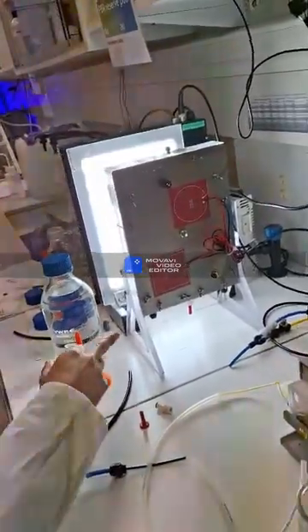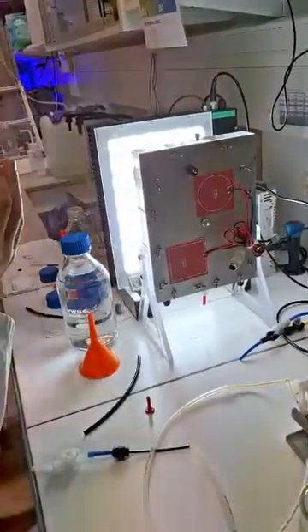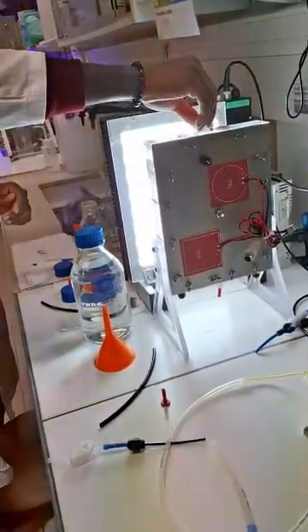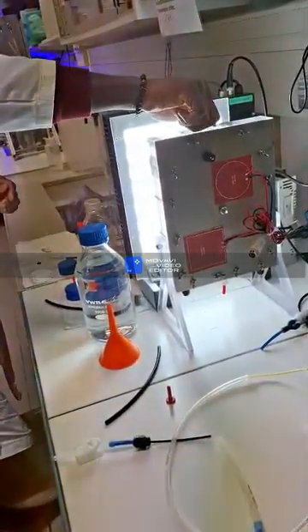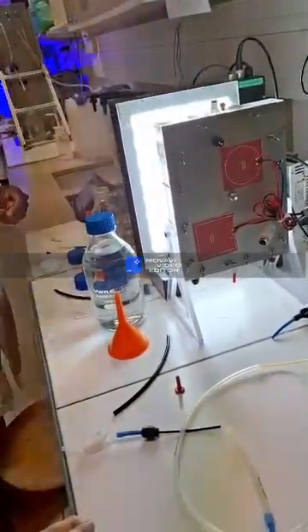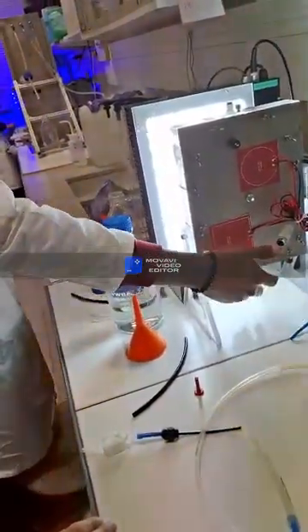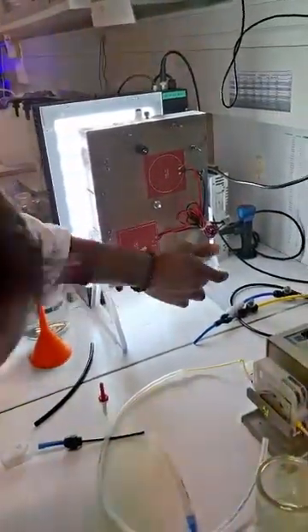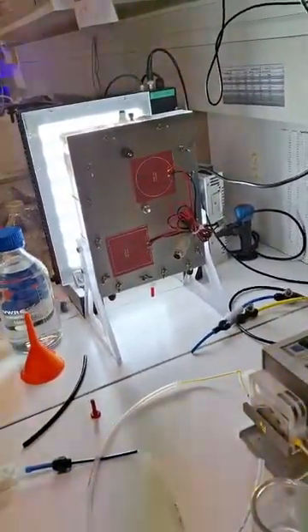But for the rest, one is for supply of carbon dioxide gas, because we have to supply it, and the other is for air and CO2. One of them is for air and the other is for CO2. But for example, in the middle, you can have both injections of air plus CO2.